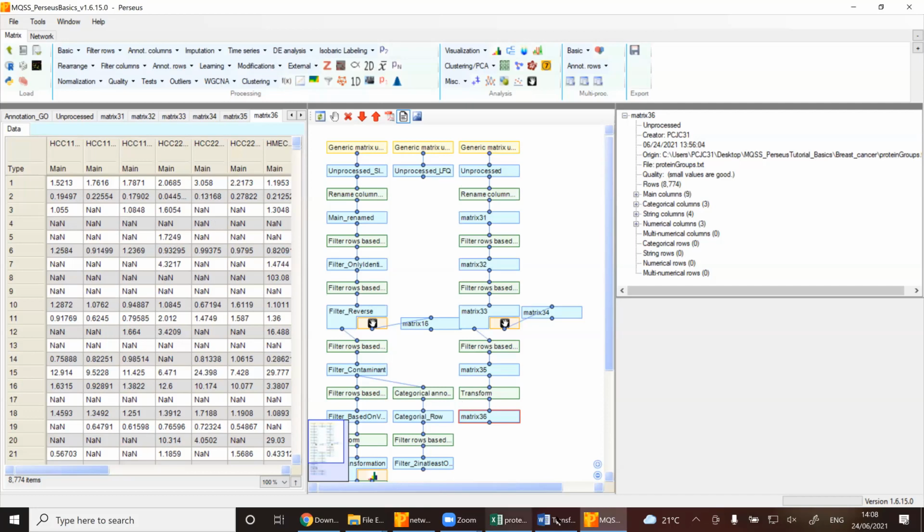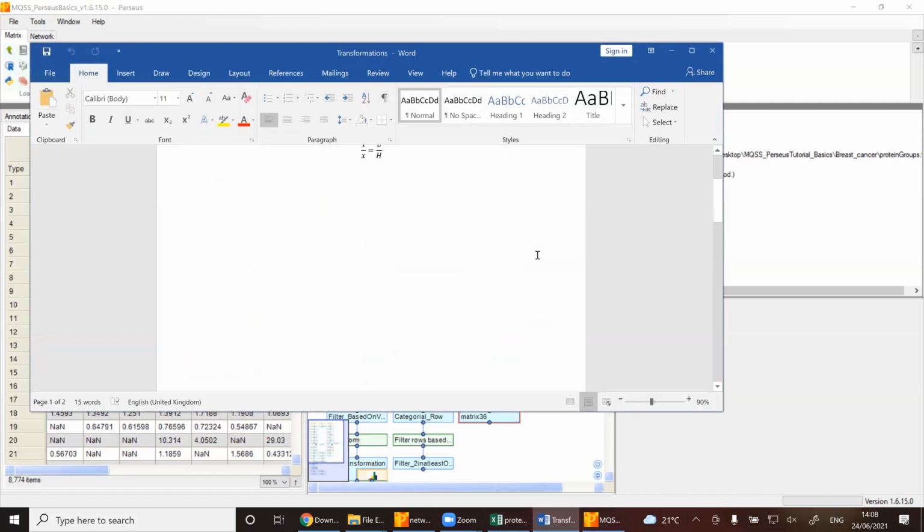So what you do now is the log2 transformation. Let me show you here, because this then allows us, so we have light to heavy labeled, and if this is 1 and you do the log2 transformation, then you will end up with the exponent, which is 0, and this is exactly what we want. If nothing has changed or hardly anything has changed, it should be close to 0.